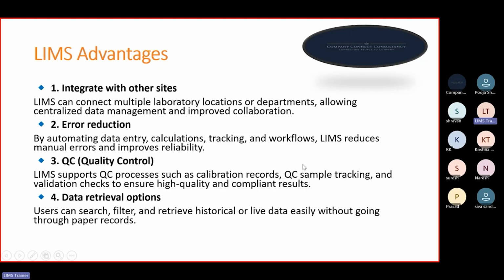Now, quality control. LIMS supports QC processes such as calibration records, QC sample tracking, and validation checks to ensure high quality and compliant results. So LIMS is widely used in quality control laboratories. That is very beneficial for quality control purposes.